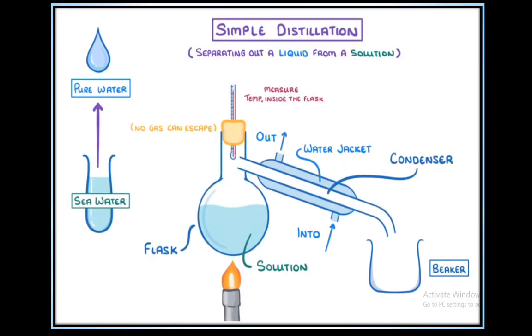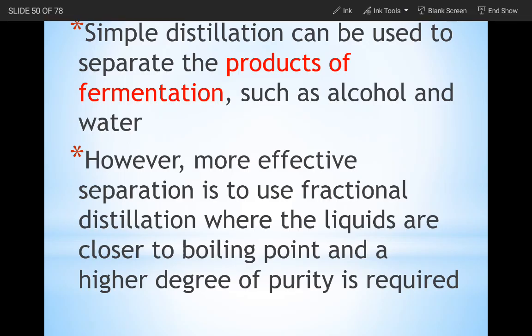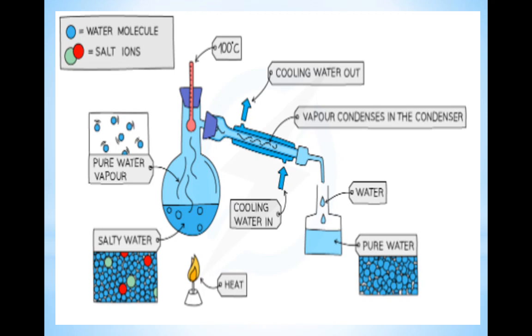Moving on. This is also a diagram for distillation. In this Liebig condenser, there are two sides, one is cooling water out and one is cooling water in.